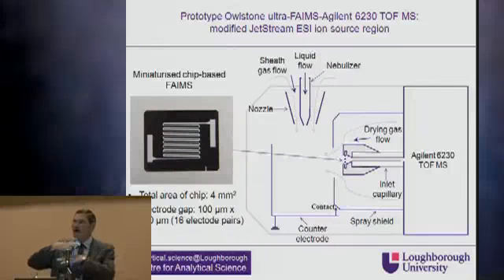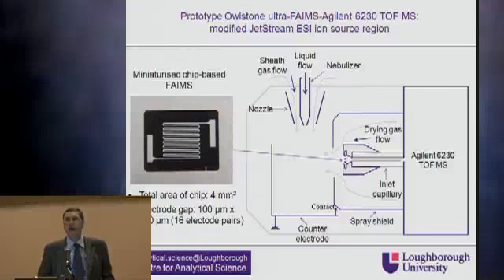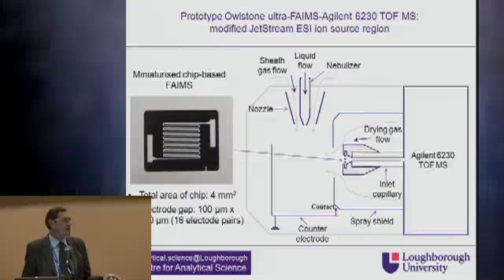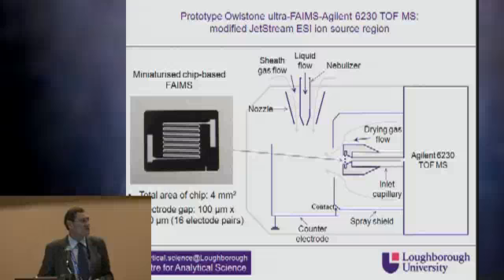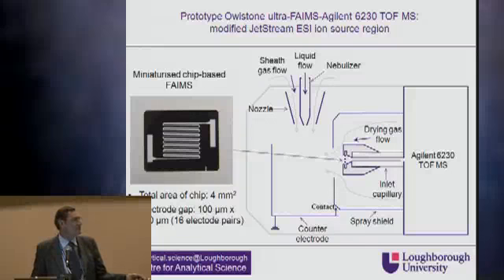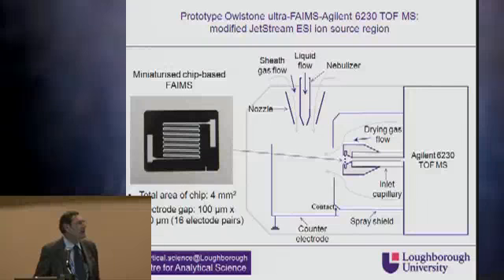And so each electrode pair acts as a separate ion mobility spectrometer, which has an electrode gap of 100 microns. That's between each pair of electrodes along here, where the white is, that's the 100 micron gap. The ions pass down and along the FAIMS device, and in these devices, that's 700 microns long. As I said, there are 16 pairs of parallel ion mobility FAIMS spectrometers here, so that a swarm of ions passing into this device will be separated by FAIMS.